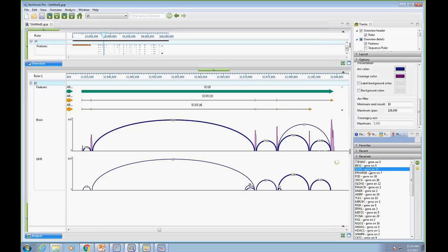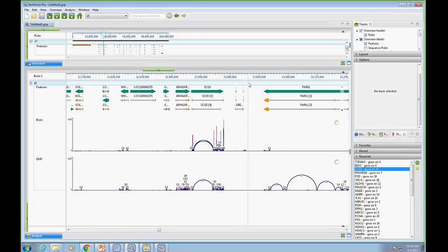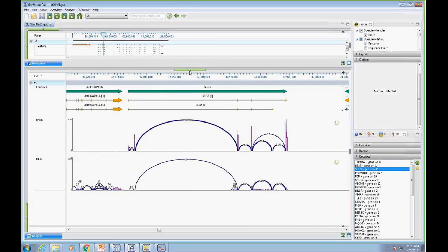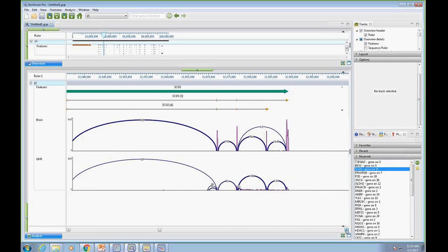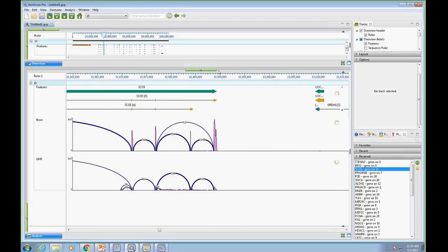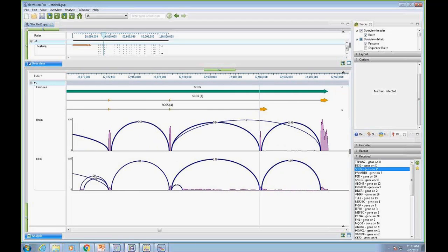I can go through this list, and it's just a great tool. I can zoom in and out. Focus on areas of interest. So here's kind of a classic form where it looks like we're skipping an exon in the middle. Not a lot. The arc count suggests that most of the isoforms go to the typical pattern, and it's more rare, but it's an event that does occur.